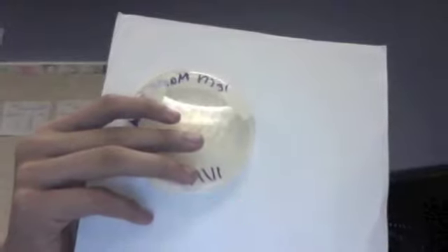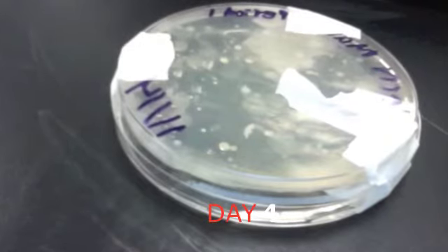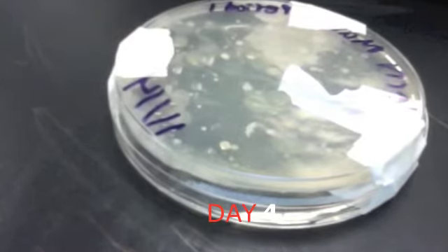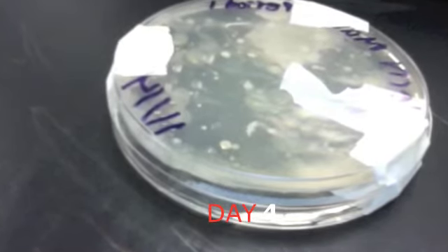This is day one of the swab. This is bacteria on day four. There are four different colors: C3 and yellow.